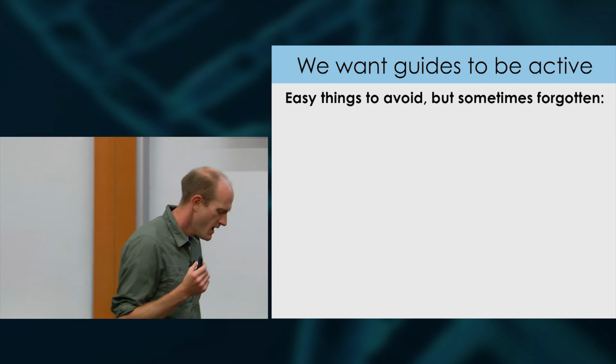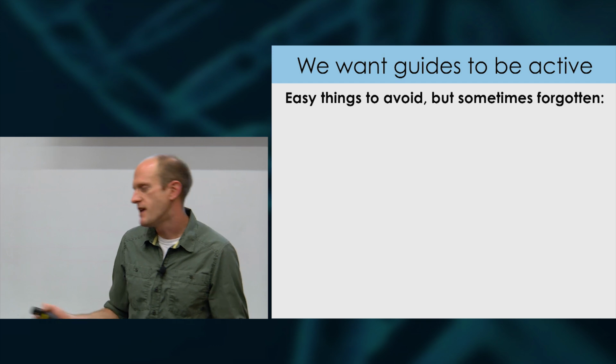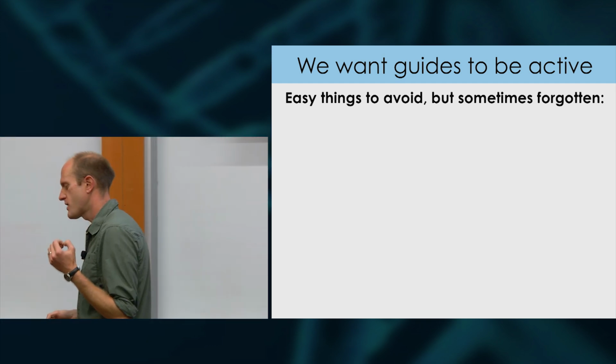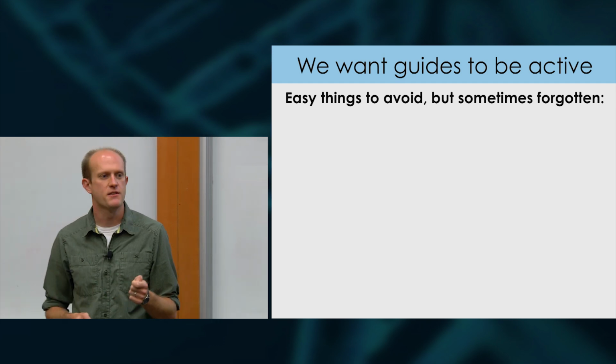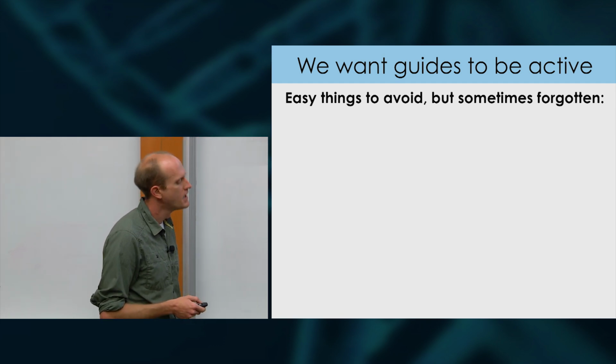OK. So the first big problem: we found guides, and we want to know which of these 10 guides is going to be the most active. There are a couple of really easy things here that are sometimes forgotten that I wanted to point out before we get to the more subtle approaches.